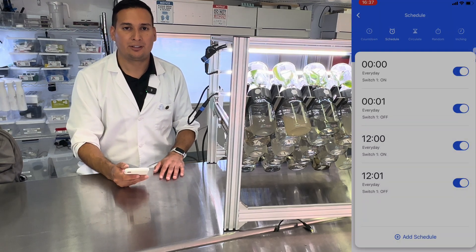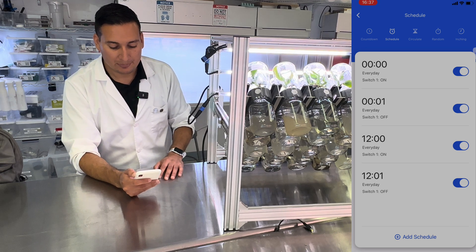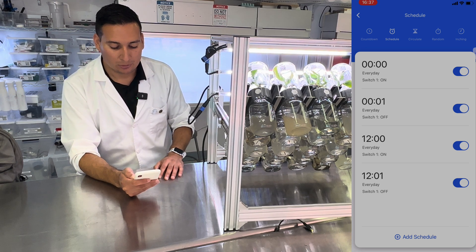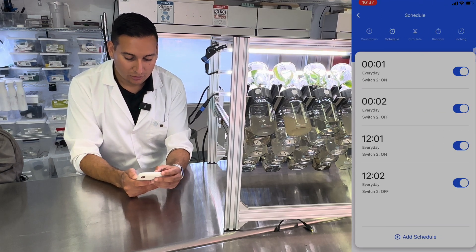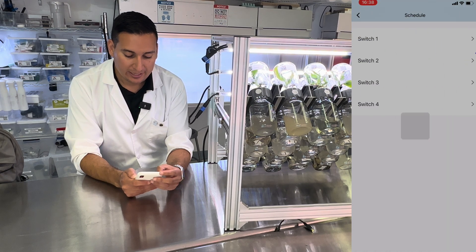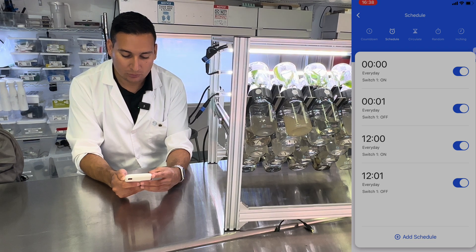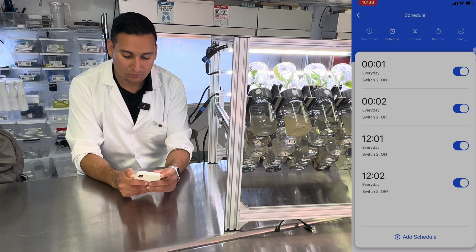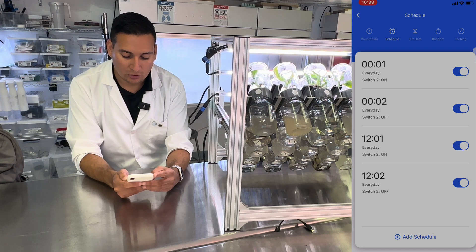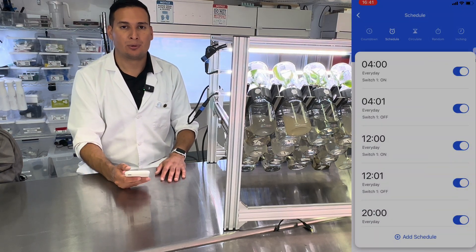If you want to turn your BioTil twice a day, every 12 hours, this is how the timer will look. It will turn on at midnight, then after one minute it will turn off. Then on switch number two, it will turn on at 12:01 and turn off at 12:02.